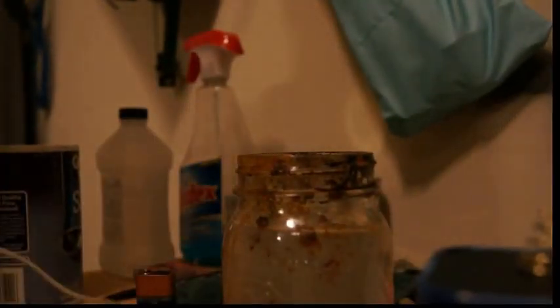Hey guys, David here and today I'm going to be showing you how to make iron oxide for thermite or any science experiments that you'll need.